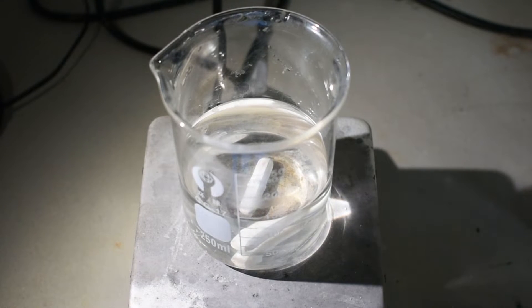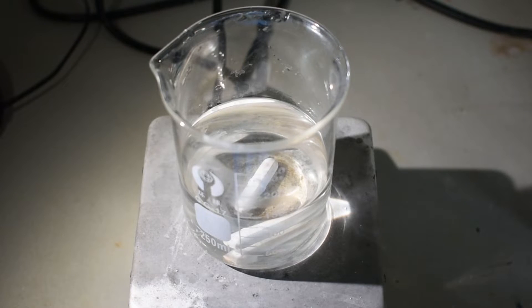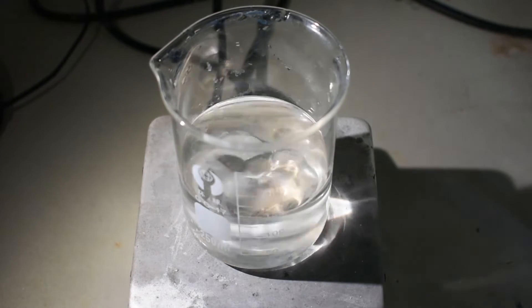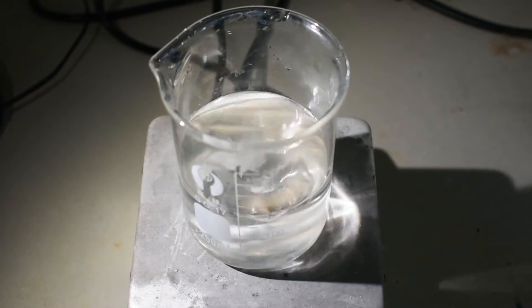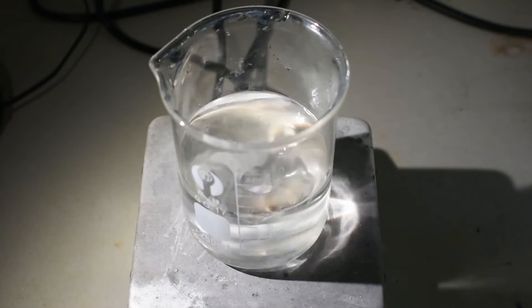Alright, now that everything has dissolved and we have a clear solution, I'm going to turn on the stirring and slowly add some ice cold hydrogen peroxide. Again, I have 30 milliliters of the 35% grade.